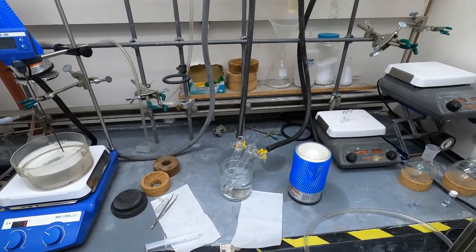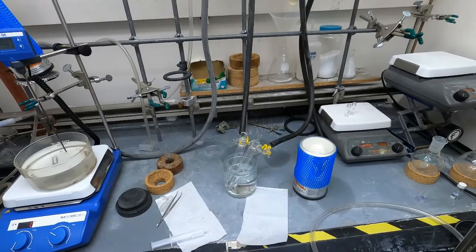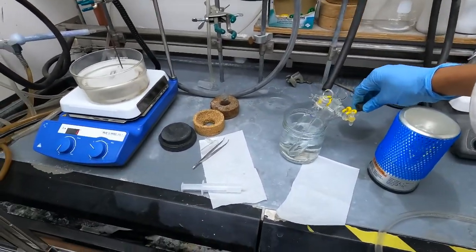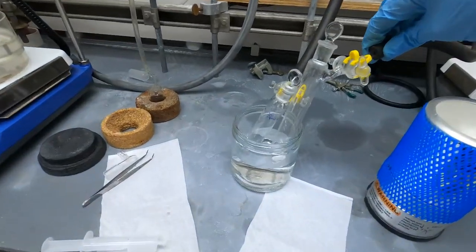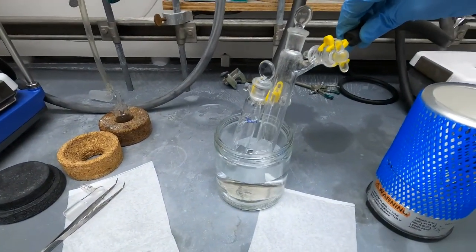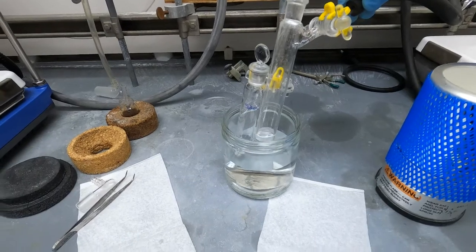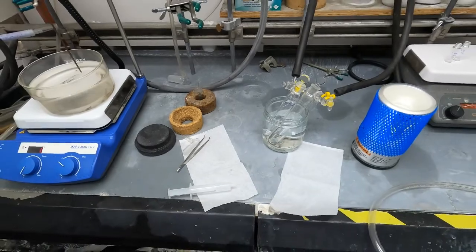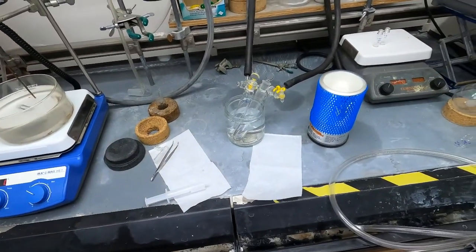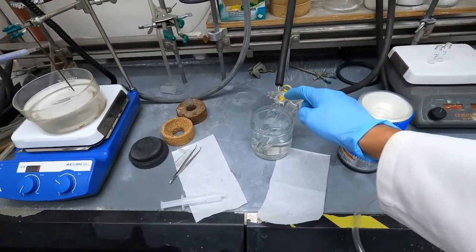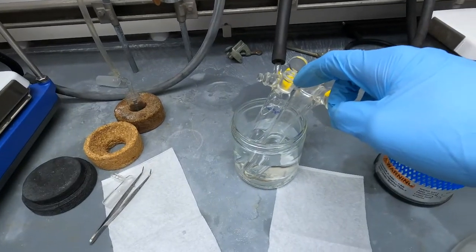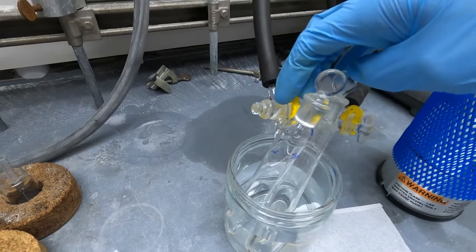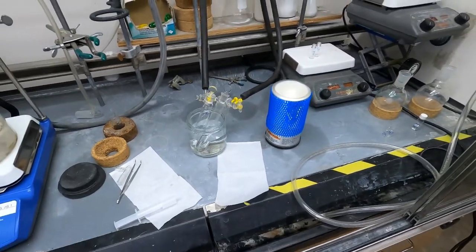A couple things that you're going to need before you get started with your freeze pump thaw. I have here two different reactions in Schlenk tubes. A Schlenk tube is a pretty basic piece of glassware. We have an opening here that's shut and then an opening with a stopcock that's connected to my Schlenk line.